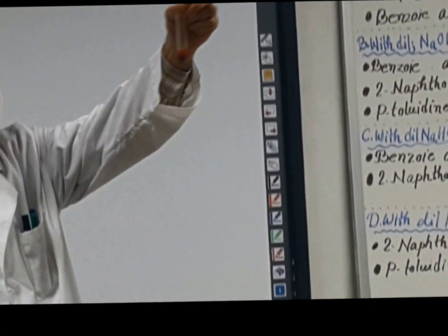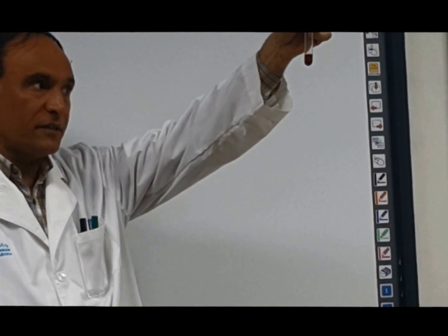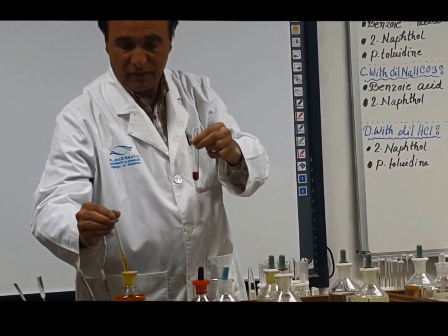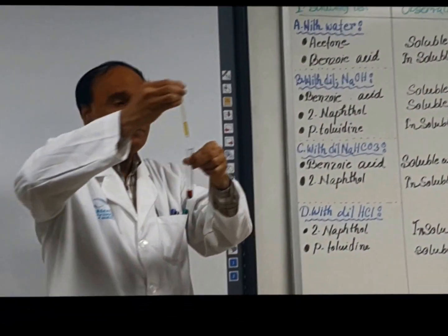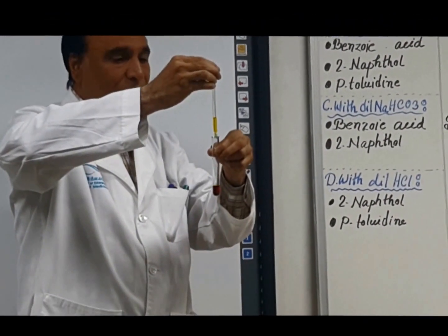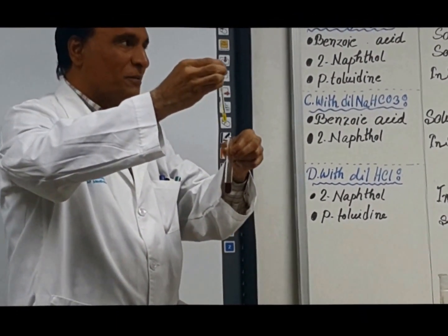Look over here, there is red color, which means that there is a hydroxy group present. Did you understand? When I am putting something, boys, look over here. When I put something, I don't bring the dropper down. I am putting it from the top. And I'm not touching it with the wall of the test tube.